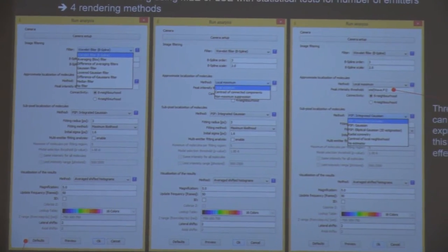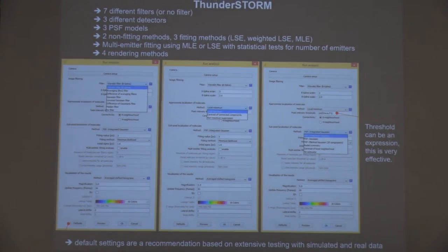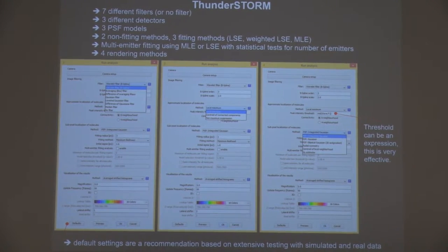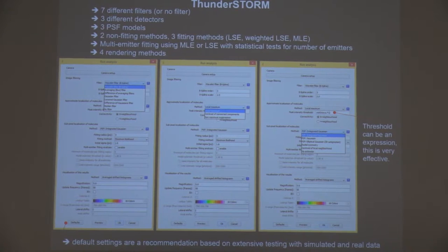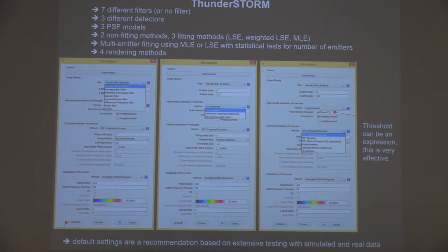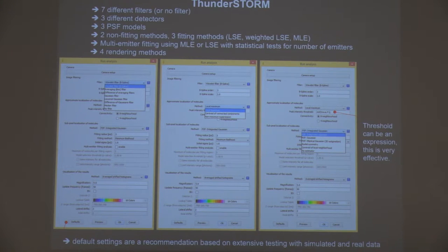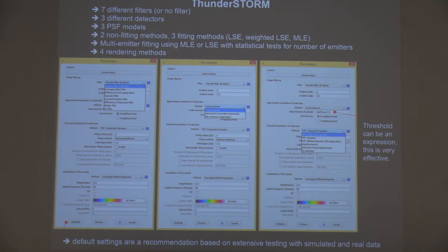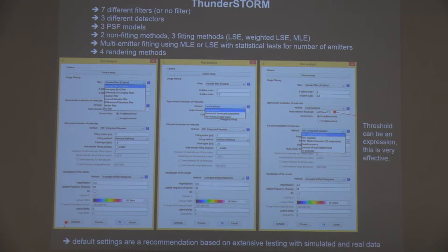We have several different options for each step: seven different filters, or you can choose no filter; three different methods for detection; different PSF models; two non-fitting methods or fitting methods with least squares, weighted least squares, or maximum likelihood methods. We have Keith Lidke's multiple emitter fitting analysis that can use either MLE or least squares, with statistical tests to determine the proper number of molecules. And finally, four different rendering methods.